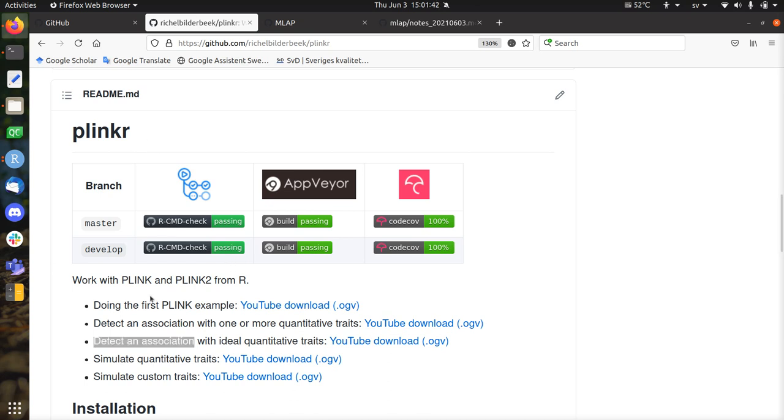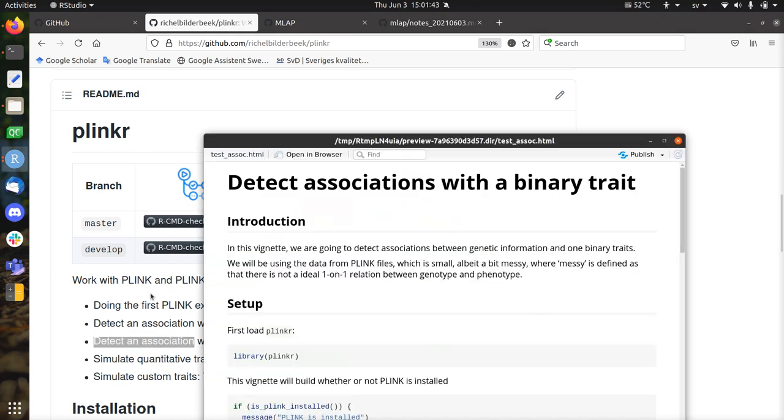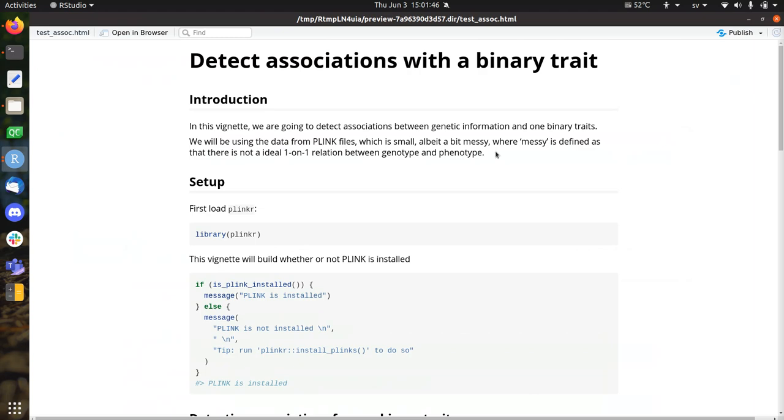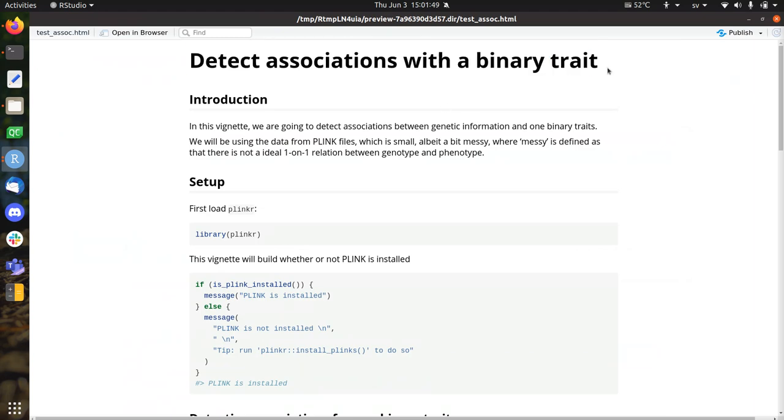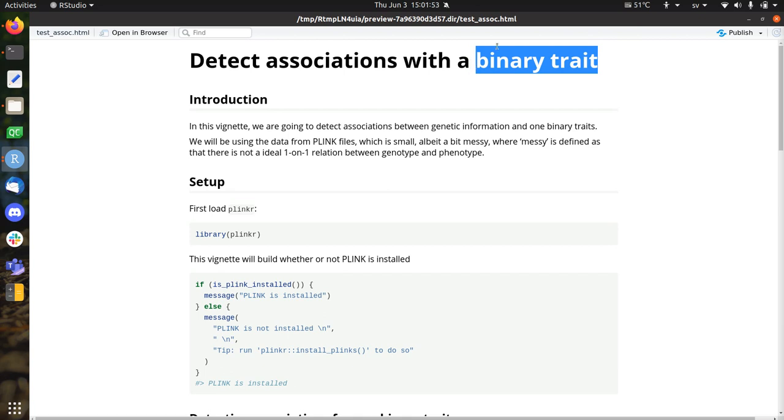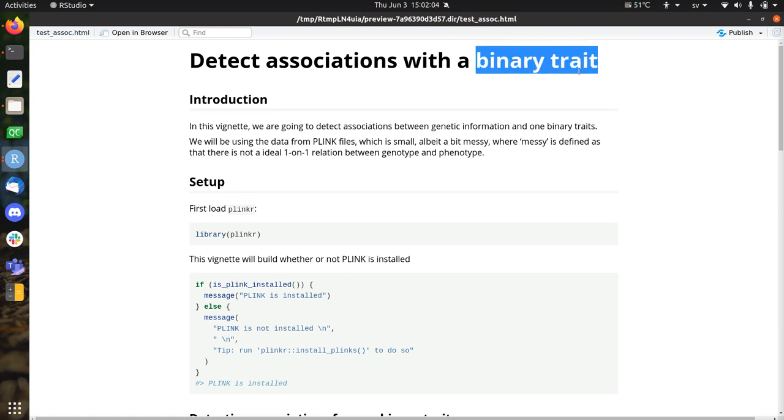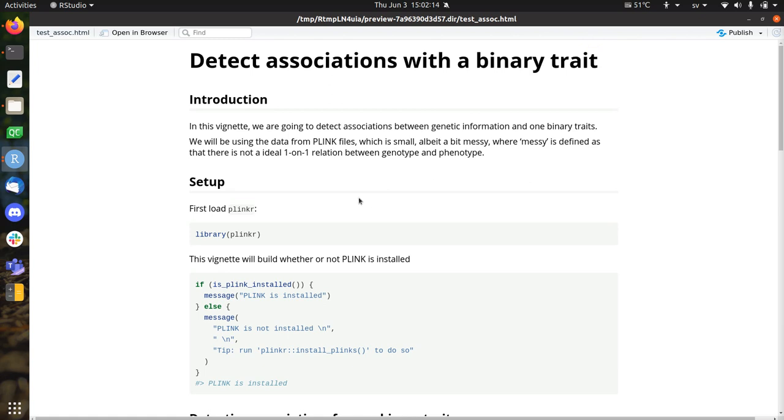Let's talk about, so there's a vignette in Plinkr, how to detect associations with a binary trait. And the binary trait in this case is synonymous with the case control variable. So let's say if you have a disease, either you're the case or you're the control and that's a binary trait. And I will use these two traits synonymously here. And we're going to detect associations between a genotype and a phenotype. And the phenotype is the binary trait.